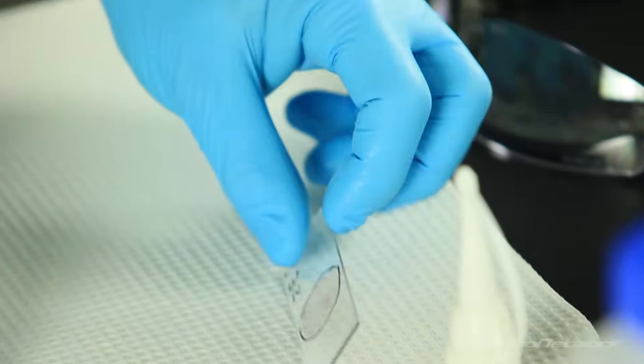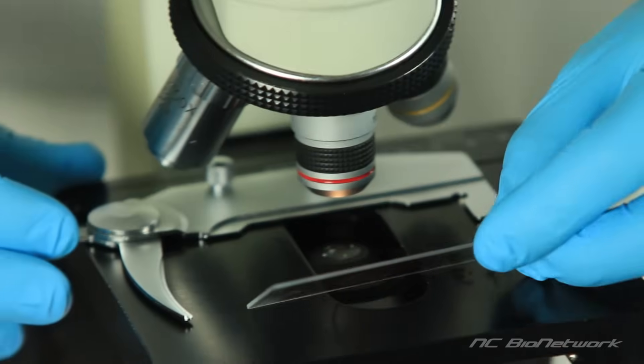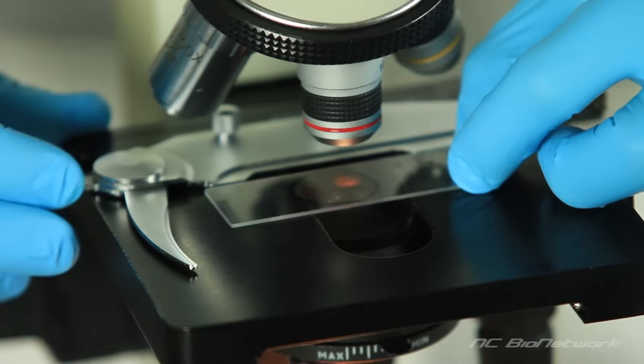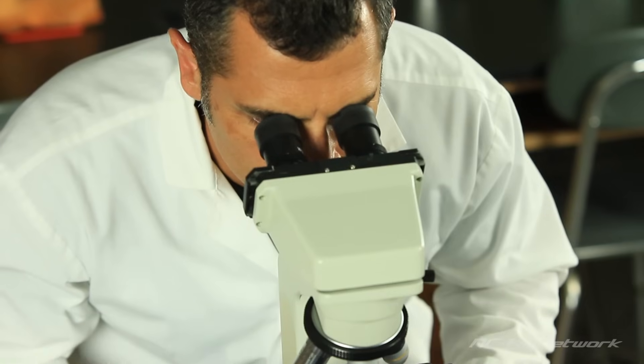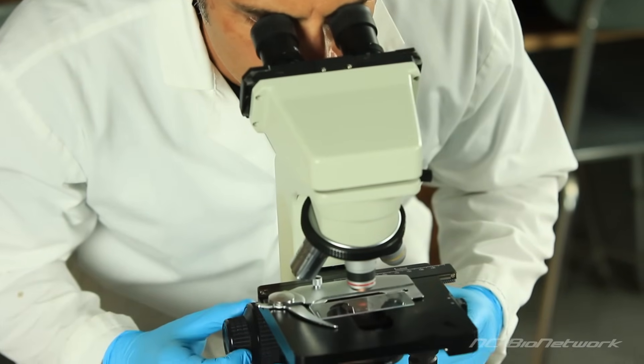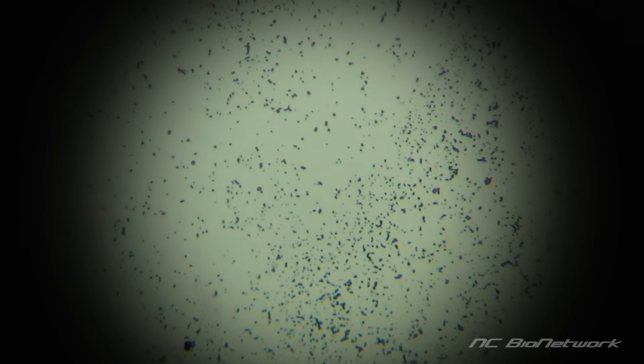Load the stained slide onto the microscope stage. Always start with the lowest power objective. Use the coarse and fine adjustments to bring the bacteria into focus.